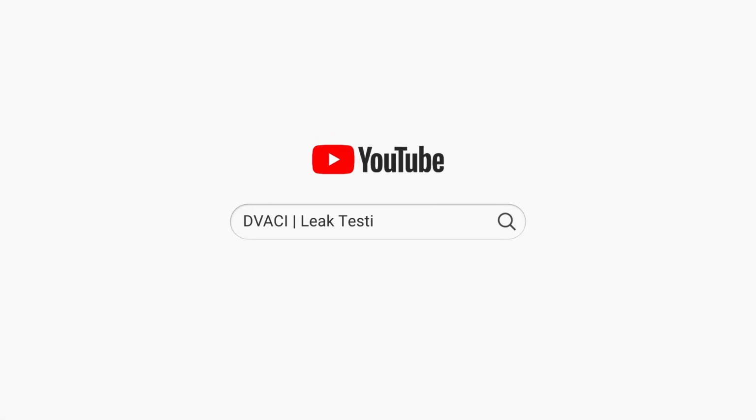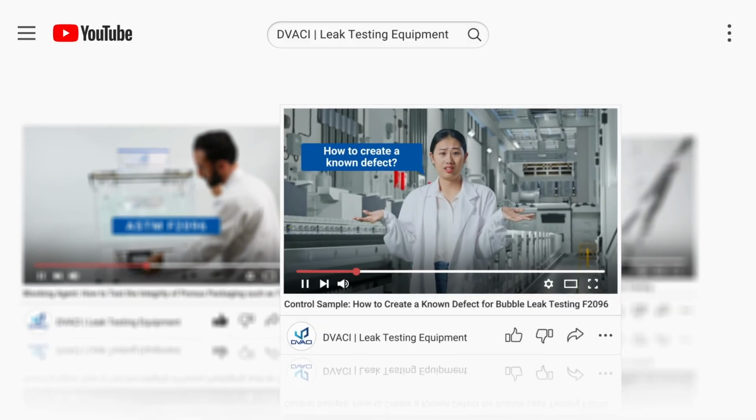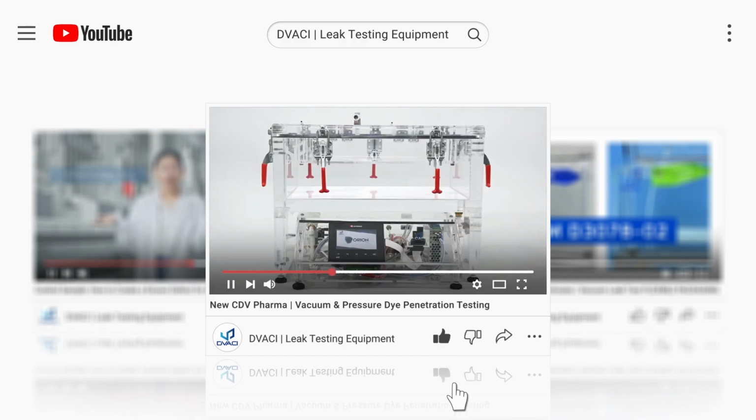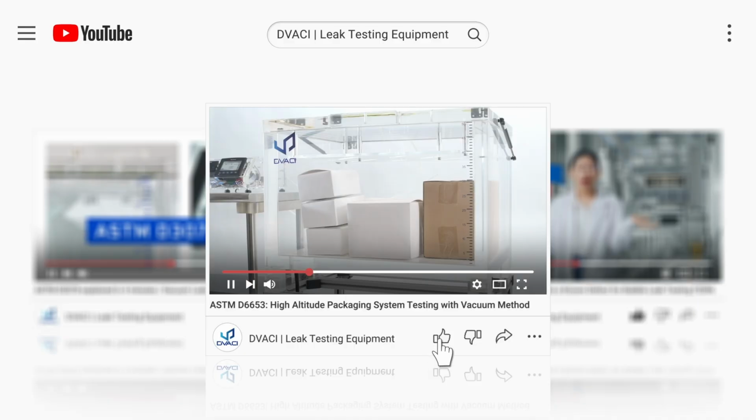We will soon publish 2 videos with real-world examples, one for a non-porous package and one for a porous package, where we will show, step by step, how to define test parameters according to ASTM F2096 in practical pharmaceutical applications.